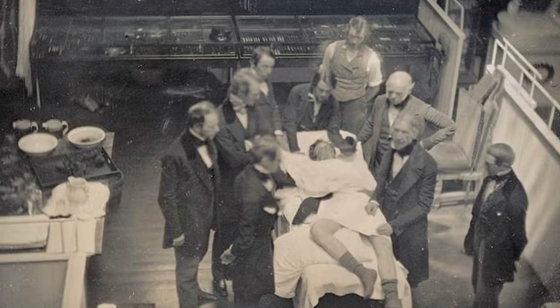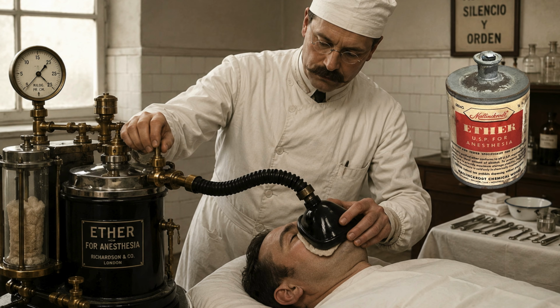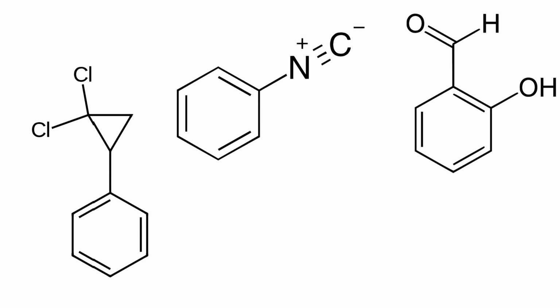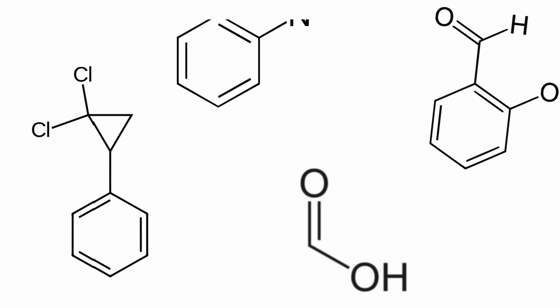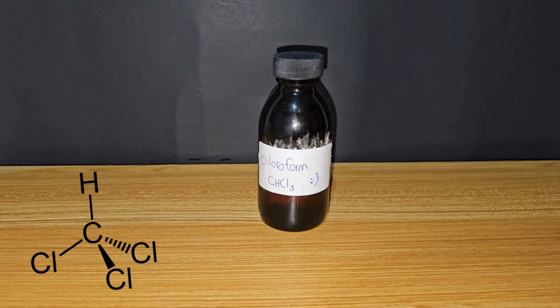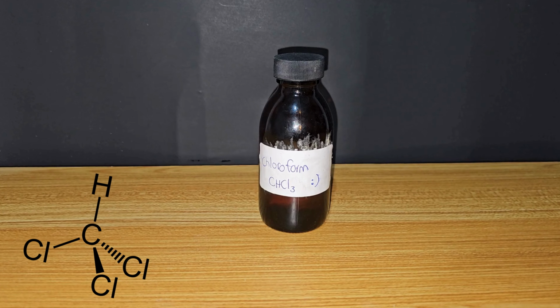Once used for anesthesia and as a narcotic, then replaced with diethyl ether because of its high toxicity, often useful for some organic reactions, and very functional as an extraction solvent. Yes, I'm talking about chloroform or trichloromethane.